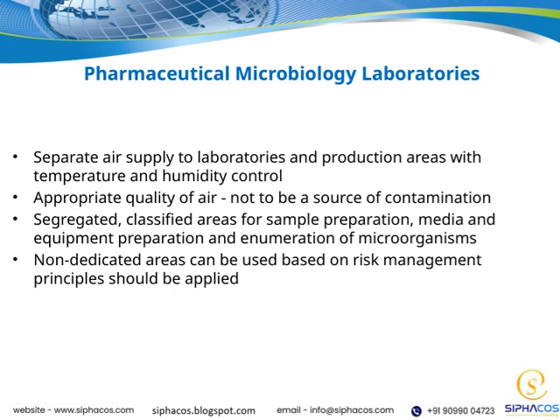Of course, not all areas need to be dedicated solely to microbiology. Based on risk management principles, non-dedicated areas can be used, but only if proper controls are in place. This flexibility allows for efficient use of space while still maintaining the integrity of our microbiological processes. All these measures together form a comprehensive approach to ensuring that our microbiology laboratories operate under optimal conditions, supporting the overall quality and safety of pharmaceutical products.